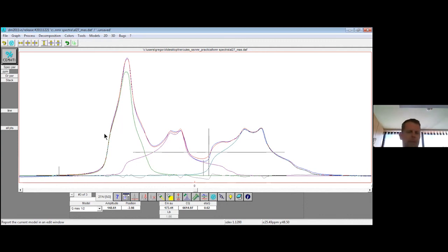If you have the energy, we can do another example of the deuterium spectrum, or if you have had enough, I can just say a few words about some tools or places where you can find help for the assignment of different NMR signals to individual lines.